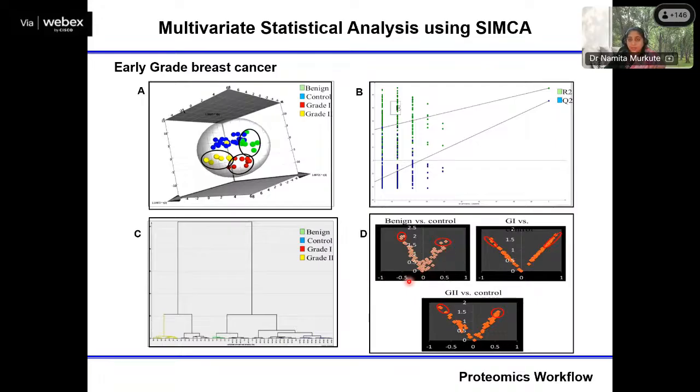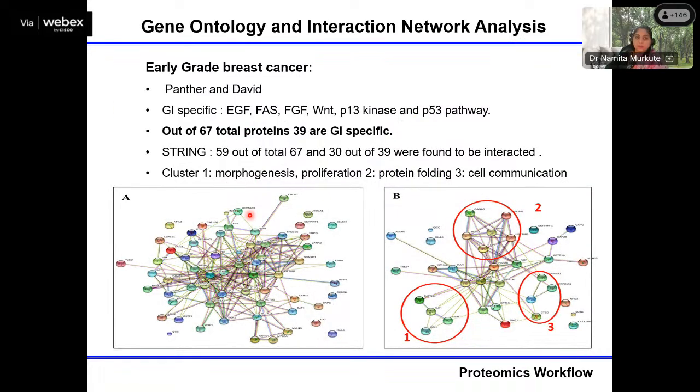Here these are negatively regulated proteins, and these are positively regulated, meaning positive fold: two-fold upregulation, here 2.5 upregulation, and here two-fold downregulation. Further, the proteins which I got through my volcano plot, I have used to identify protein-protein interactions or network interaction analysis. It is also called gene ontology.